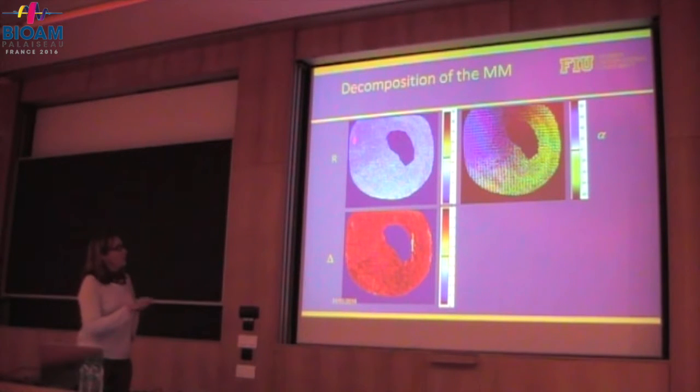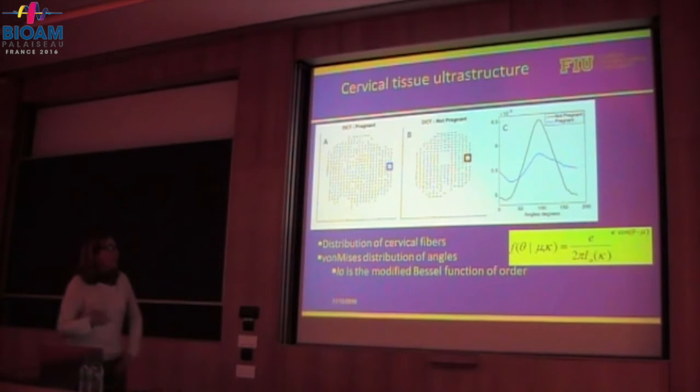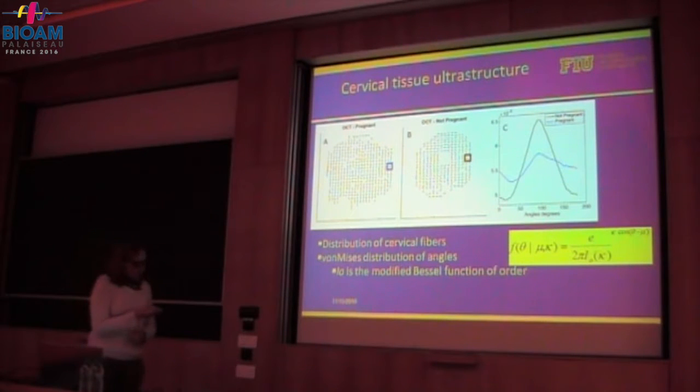So alpha, but we can also measure retardation, and we can measure depolarization, and these are numerically reasonable values similar to what has been shown by Tatiana's and the Martino's group in previous publications. Now, what is the goal of this? Of course, we can show this circular arrangement just optically, but the ultimate goal is really to quantify collagen, or the dispersion of collagen during pregnancy.